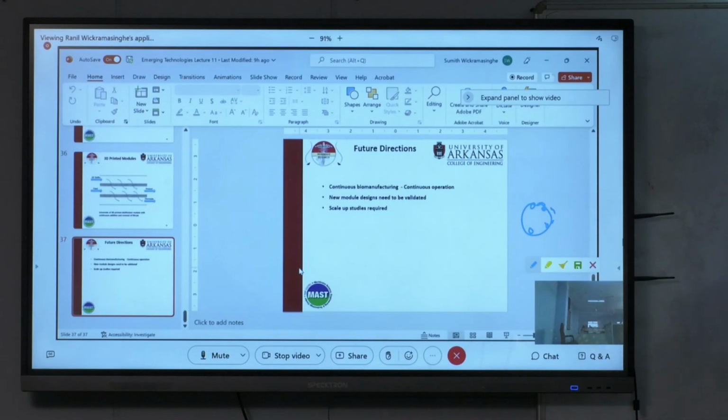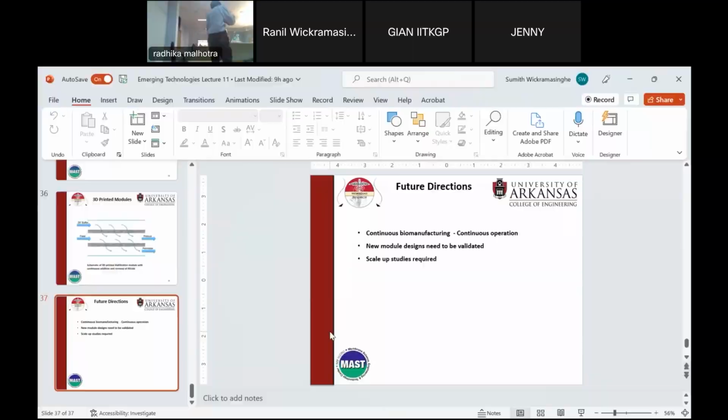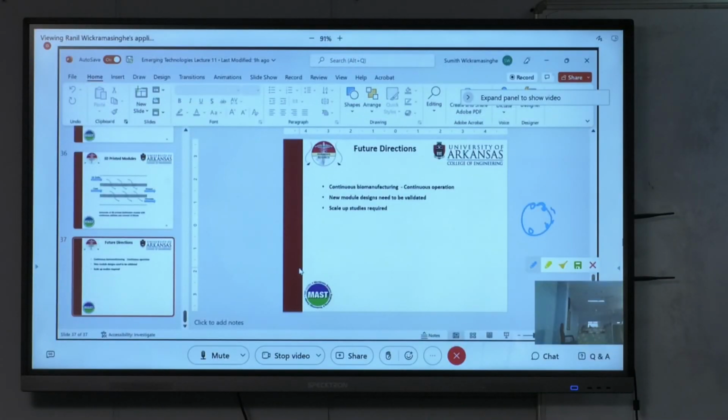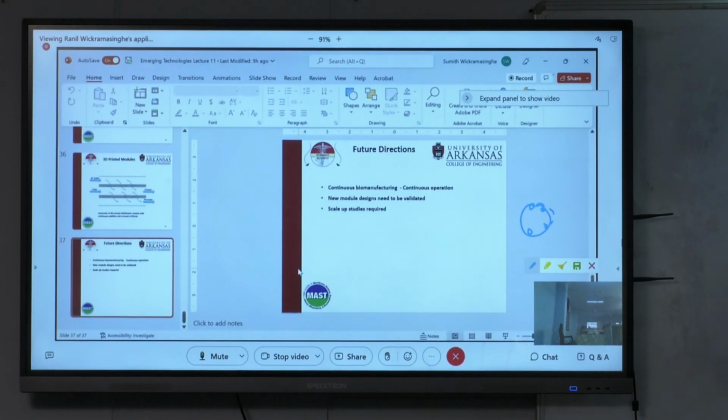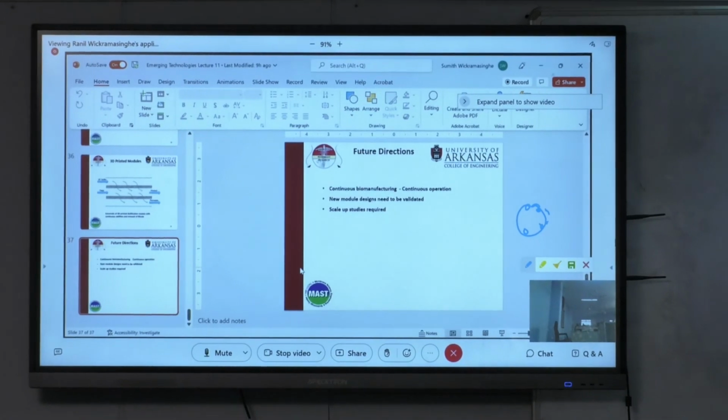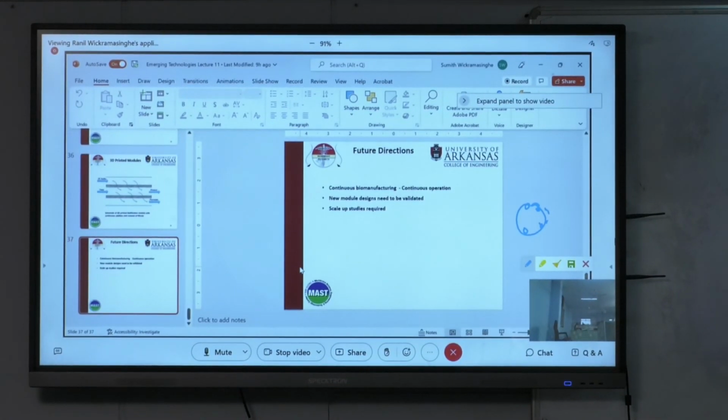Now, it can be done. I mean, there are blood pumps, okay? And blood pumps are often peristaltic pumps, and they're designed to be able to pump blood, but basically they're designed to pump red blood cells, and red blood cells are highly flexible. See, they go through our veins, they go through the lungs, so it's okay. They are flexible and they're used to this. But these Chinese hamster ovary cells are not designed to be going through these. And so if you put a lot of shear stress on them, you can stress them, and then they don't grow well, they don't produce well. That's the disadvantage. So for continuous biomanufacturing, that's a problem. Okay?